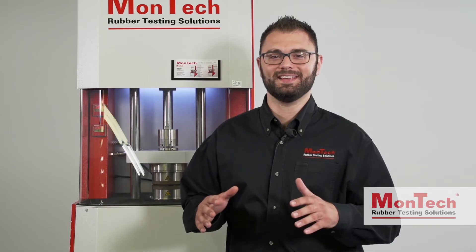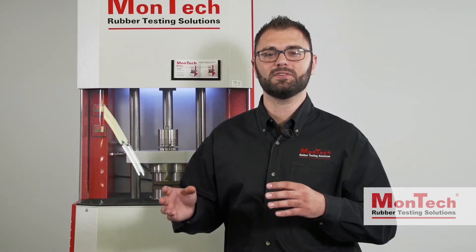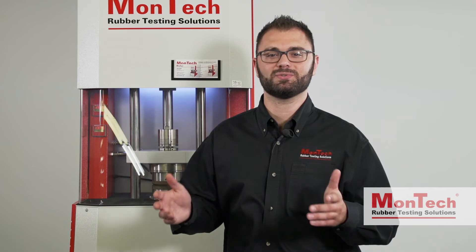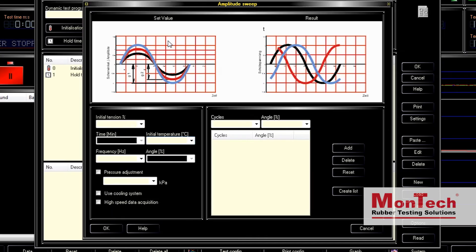Payne effect tests are very easy to set up and execute with Montech's versatile MonControl software. The test begins by conditioning the uncured sample in the RPA at 70 degrees Celsius, oscillated at 0.1 Hz with 0.07% strain for 10 minutes. After conditioning, the strain sweep is performed.